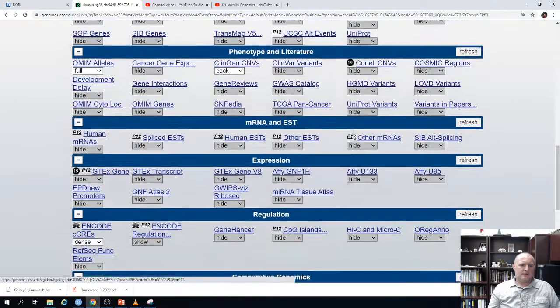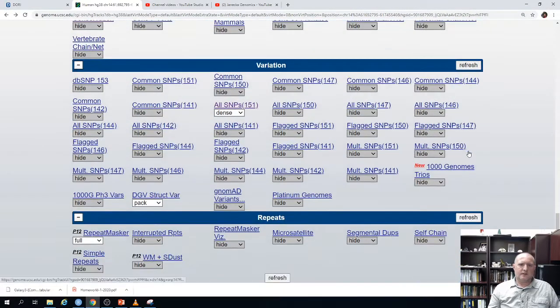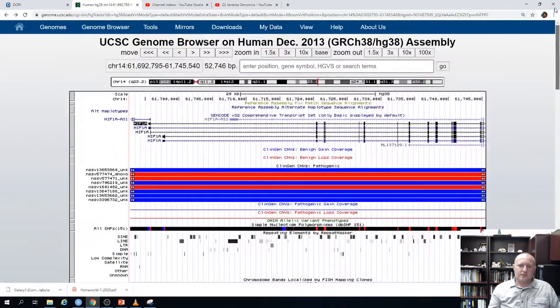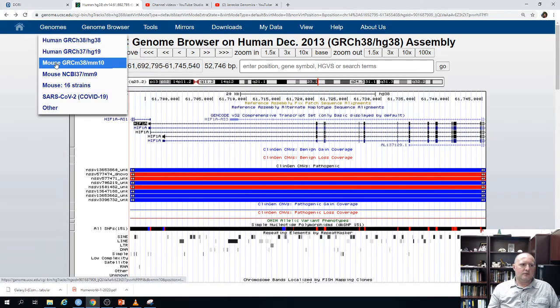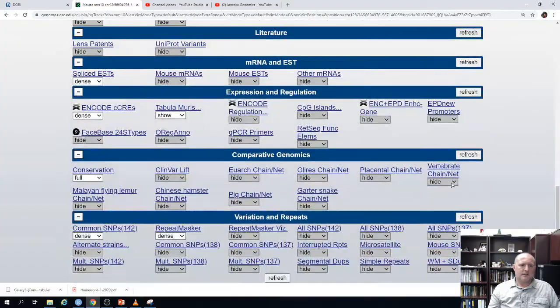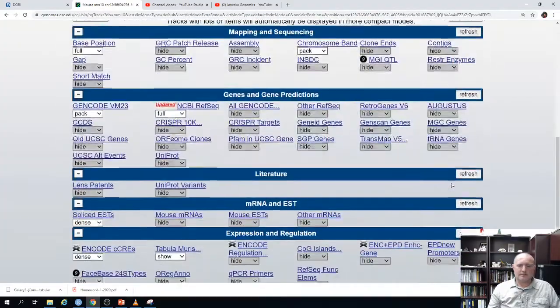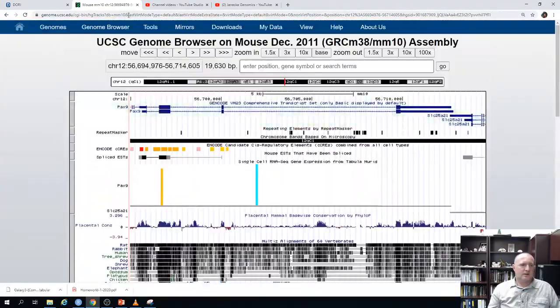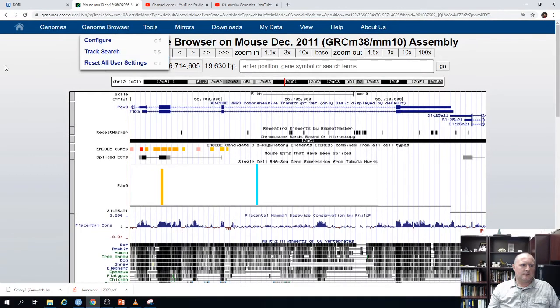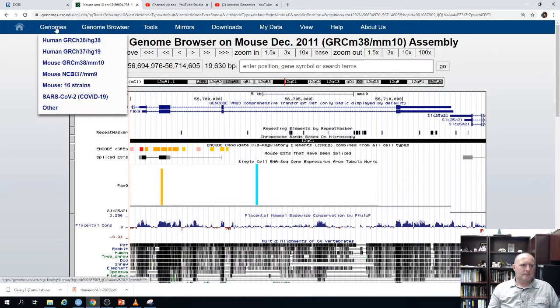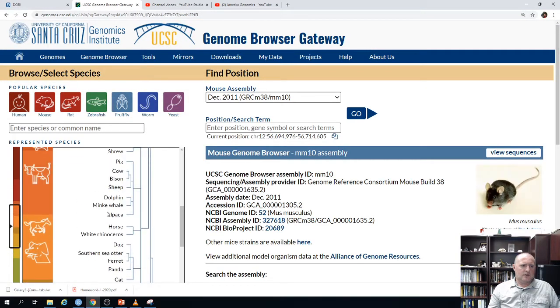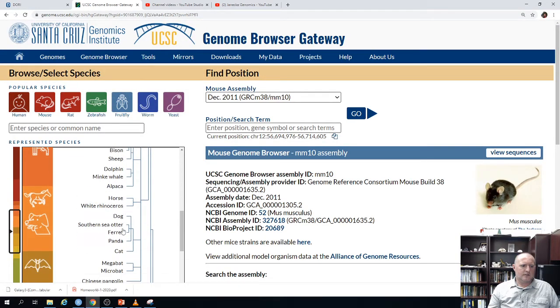There's just a rich amount of information available for the human genome. If we go to a different genome, there will be fewer tracks. For example, going to mouse, you'll see many tracks but not as many as in human. Let's look at one that's not as well studied — let's go to hedgehog and take a look at the hedgehog genome.